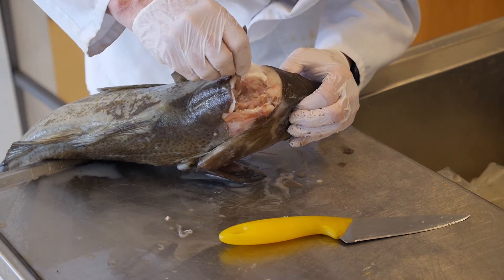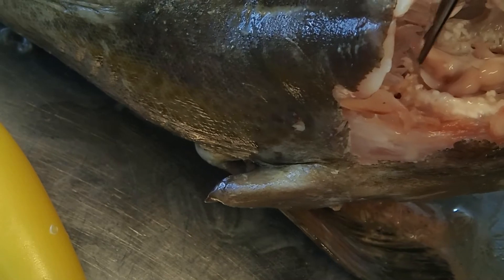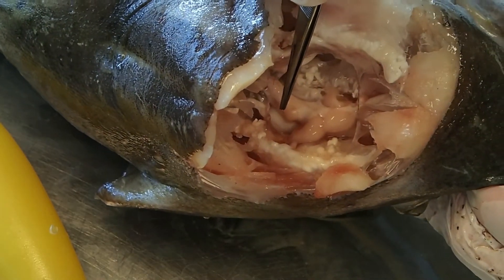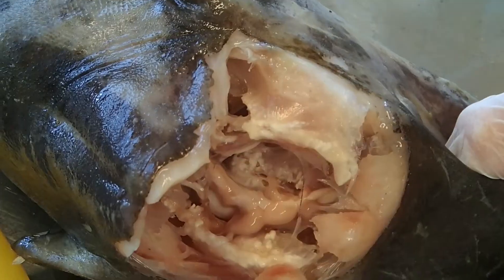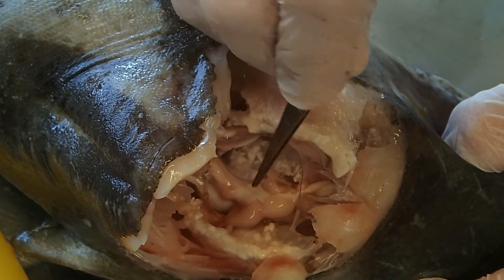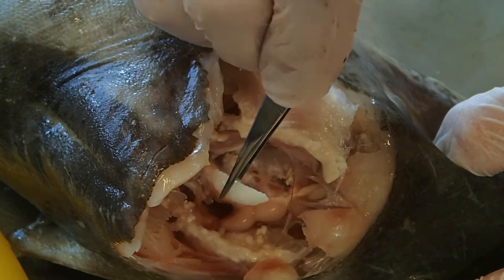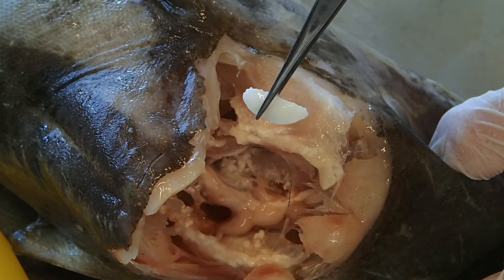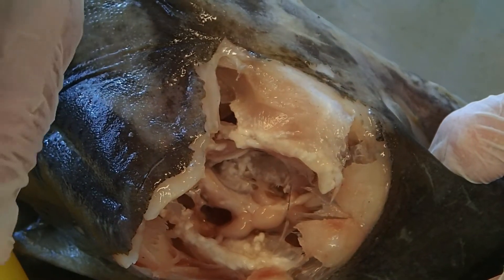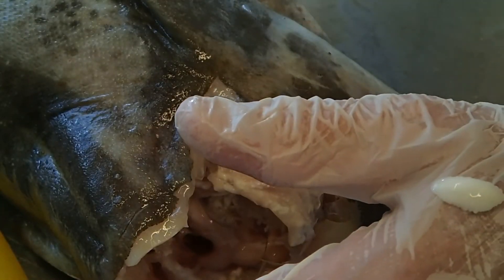Right now I can see one of these otoliths in here. I'm pointing the forceps at it right now — you can see the white of the otolith. So again the brain is here, the spinal cord going down, and there's the white of the otolith and it's not attached. I'm just going to put the forceps in — and there's the otolith. Very easy. Cod are very easy for this, it's an easy way to start. I'll put it right on my hand so I don't lose it, because the char otoliths will be much smaller.